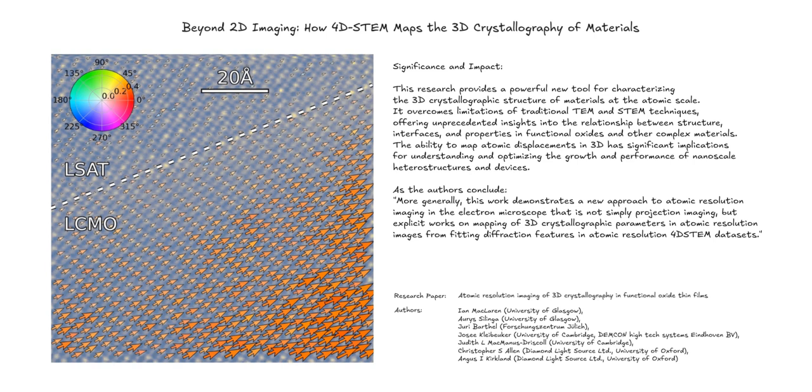The researchers were able to make this discovery thanks to the 4D-STEM technique, which allowed them to map the 3D orientation of the B-axis with atomic precision. It's remarkable how a technique that reveals atomic scale details can also provide insights into larger scale phenomena, like thin film growth.